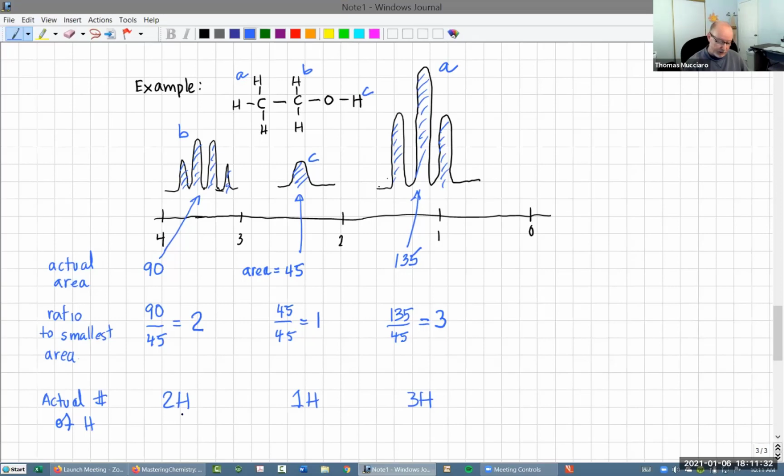But what happens is when equivalent hydrogens like hydrogens A, see, sometimes we circle them all and say those are all the same. They are adjacent to a carbon with another set of hydrogens. So this is hydrogens B, right? A and B, their signals interact and they become split.